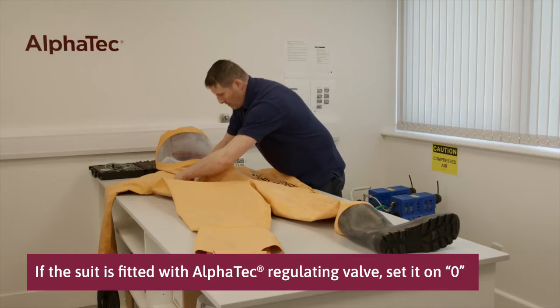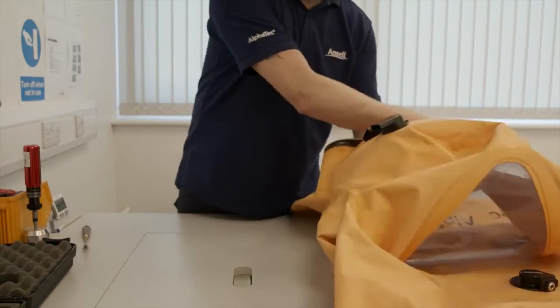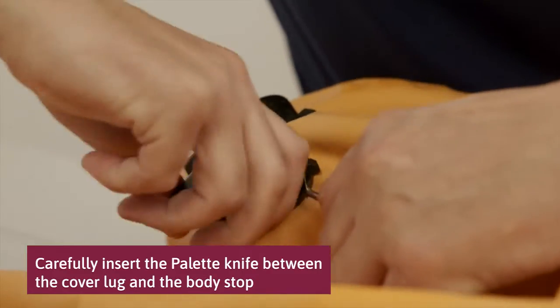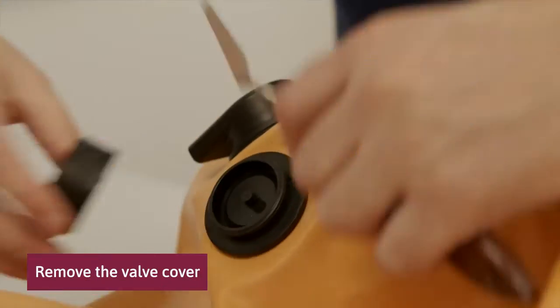If the suit is fitted with an Alphatech regulating valve, set it on zero. To remove the outer valve cover, first rotate the cover clockwise so the cover lug is 6-8mm past the valve body stop. Carefully insert the thin blade pallet knife between the cover lug and the body stop. Then turn the valve cover anti-clockwise and remove.